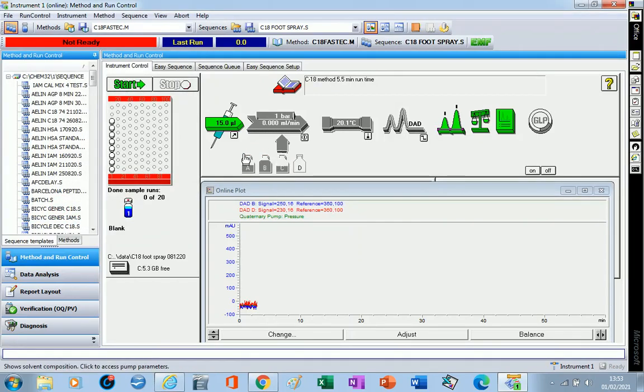You see now it is all showing how full my solvent bottles are, because I have an autosampler, and I run a lot of samples. I go home, and when it finishes the analysis it usually stops.